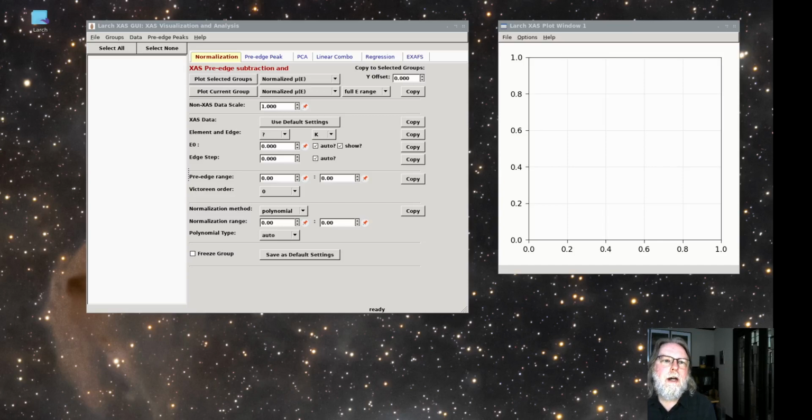Perhaps the most common method for analyzing XANES data is to treat a spectrum as a linear superposition of spectra representing individual atomic environments or coordinations. This sort of linear approach is very simple to use, is pretty well justified for XANES, and is a common approach for other spectroscopies as well, so in fact a rich set of linear analysis methods and spectroscopic tools can be applied to XANES.